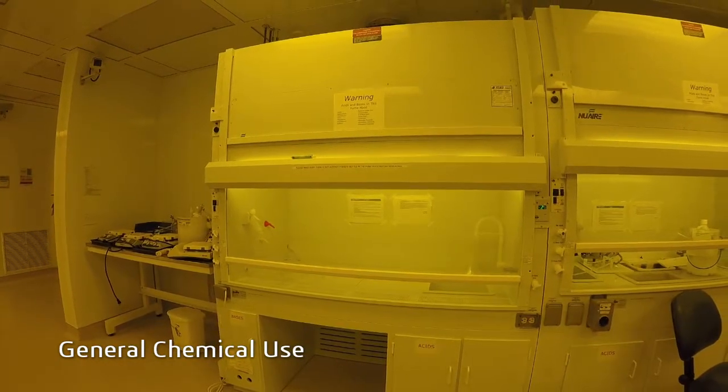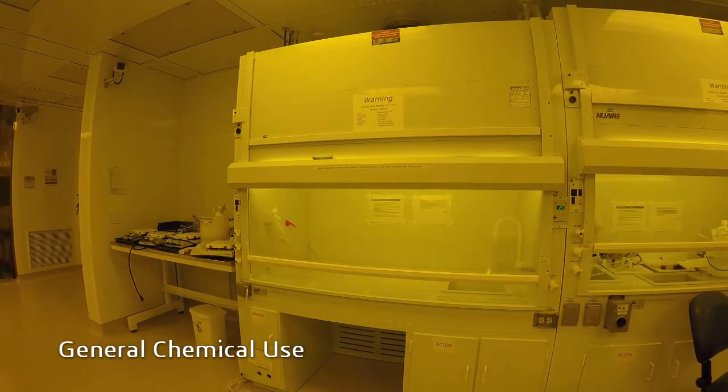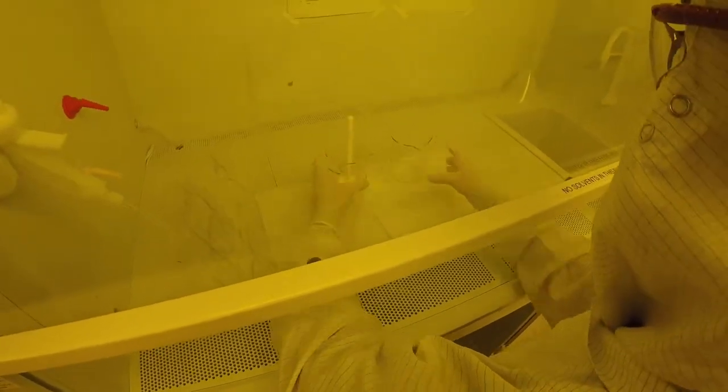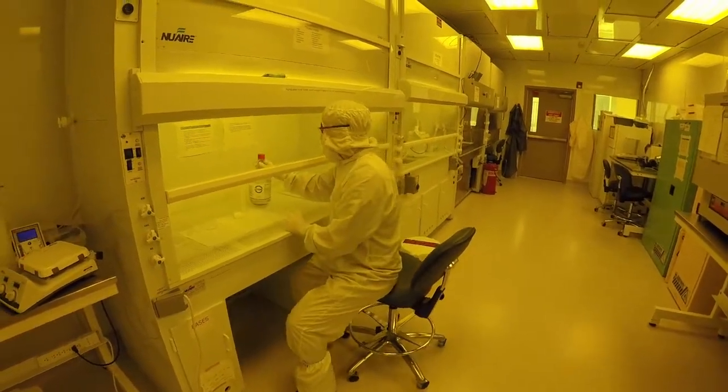Let's go over the ideal setup for general chemical use. First, line your work area with clean room wipes, making sure not to cover any vent holes. Next, gather the appropriate glassware and tools for your experiment. Then stage the first chemical of your process.